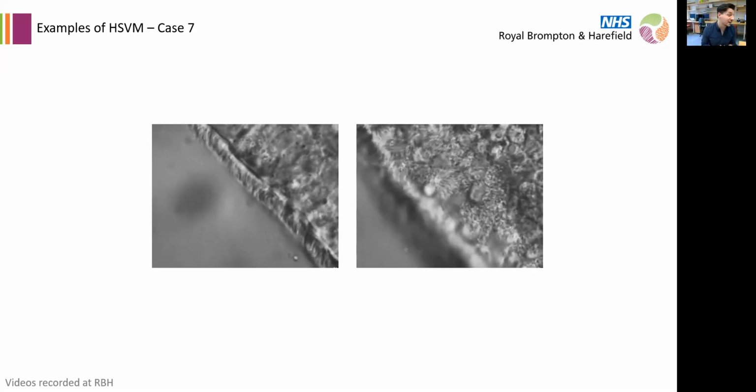Okay, so it's actually a reduced amplitude for most of them. We can see here that it looks somewhat like what they call stiff, so reduced amplitude. This is an interesting case because this patient has a mutation, which means that it's a normal electron microscopy. So that's where high-speed video microscopy can give an idea, saying, well, this looks reduced, it doesn't look normal.